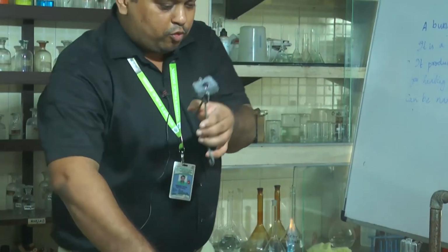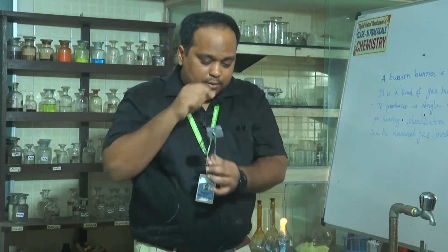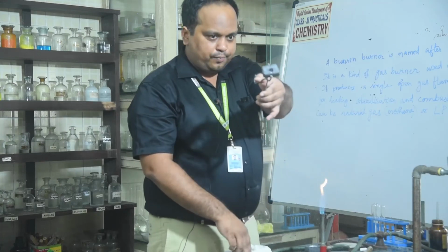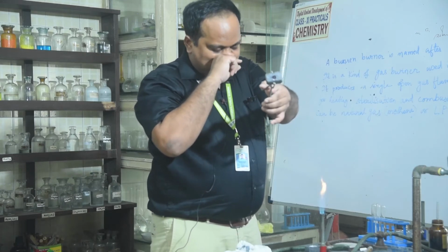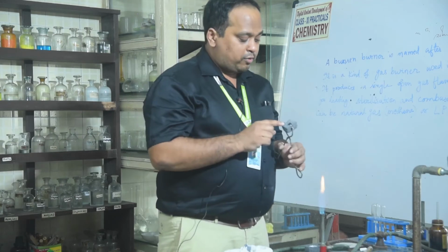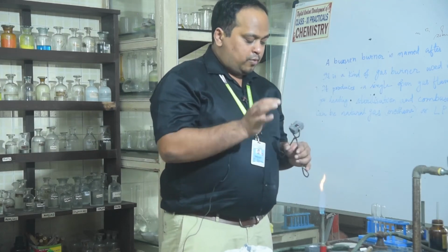You can see a blue mass here. You can see a pink mass here. You can observe this color, pink color. This pink color observed here means the presence of magnesium. Got it? Again I am telling you, charcoal cavity test: if anything is left here, you have to go for your cobalt nitrate test.